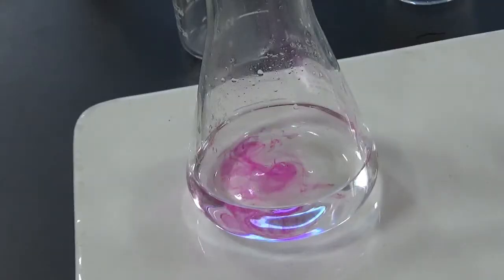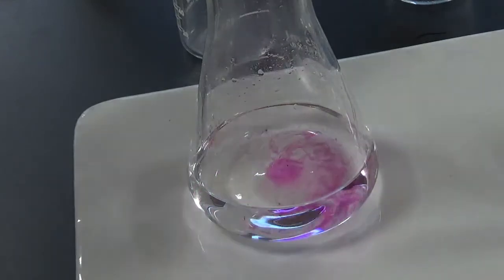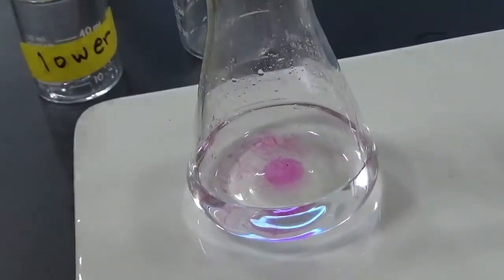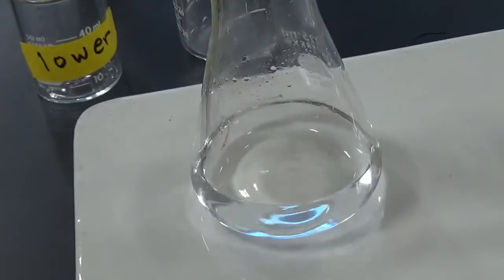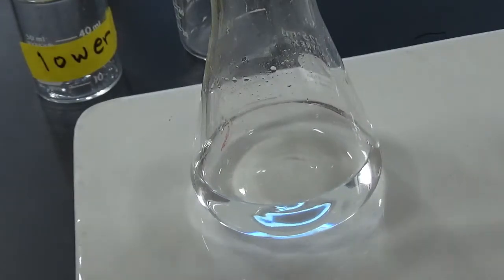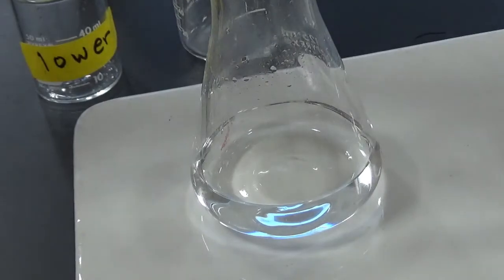All right, and now I have to do a titration. So what I'm doing is titrating that lower layer. I poured the lower layer here into an Erlenmeyer flask. Then I thought I was filming the whole titration, but in fact the camera was on standby. So I have already added about 16 milliliters. And I was thinking out loud how embarrassing it would be to miss the endpoint.